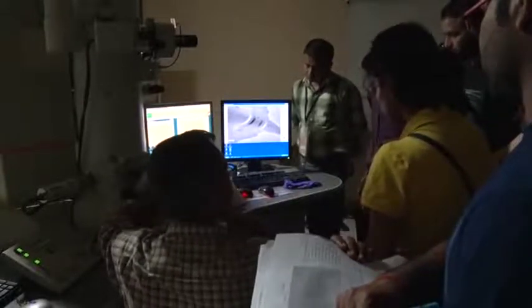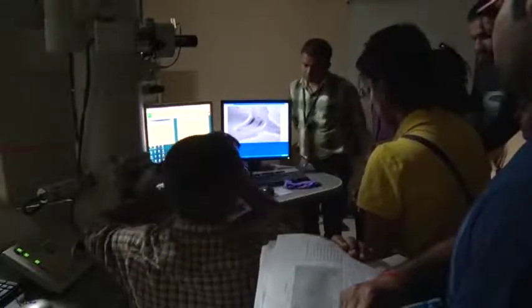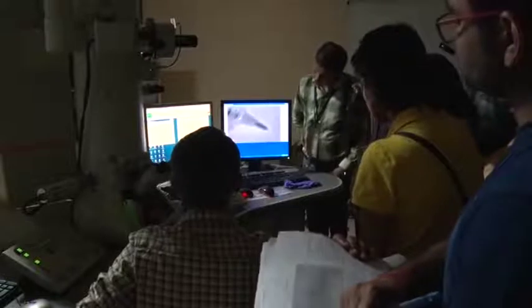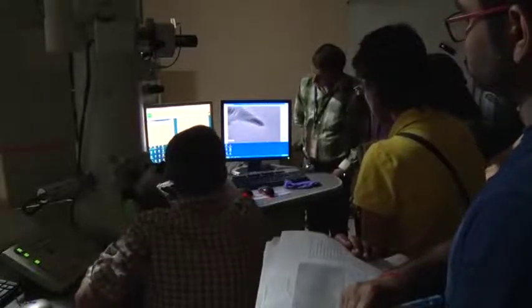Now if the sample were at the correct position, then this changing should not move the sample. But if it is not at the correct position, but somewhere here, then it will start to image different regions of the sample, and so it appears that the sample is moving. So we will do it by, let us say, this which is given here. Yeah, so I have started the image wobbler and you see it is vibrating.